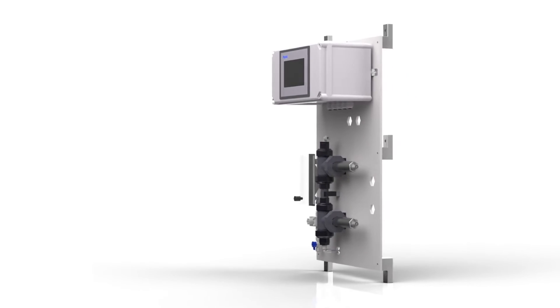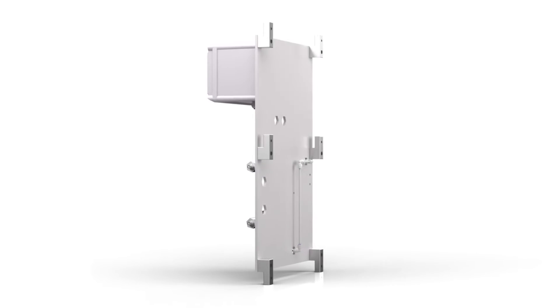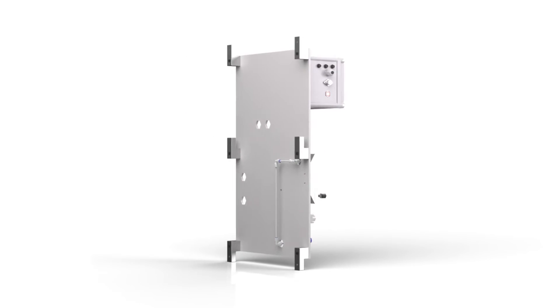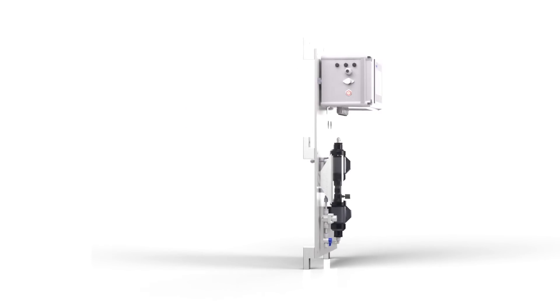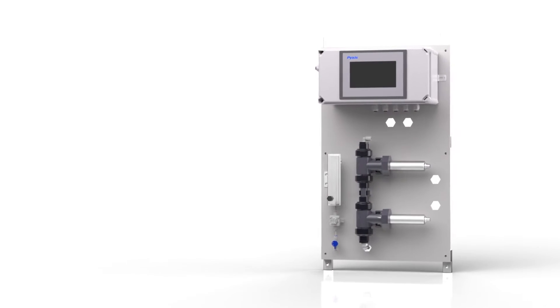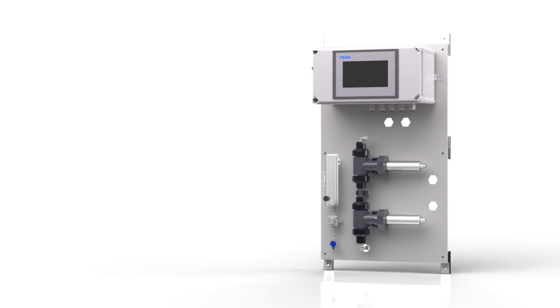The IK765 DCL panel comes prepackaged as an easy-to-integrate analyzer solution. The Pixis ST765 series sensors are installed using the uniquely designed ST001 in-line T-assemblies, providing a compact design with bottom-up flow, ensuring constant sensor flooding.